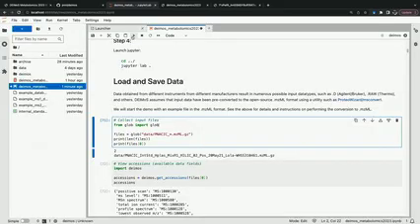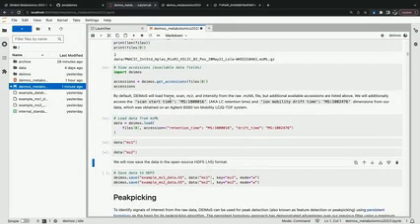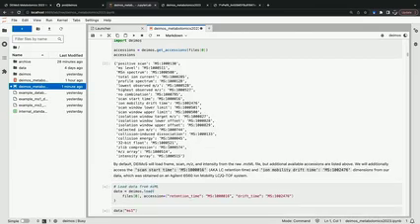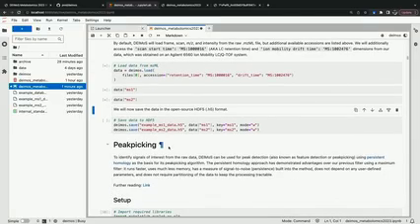So we do work closely with IVET, and I think we don't have inbuilt compatibility with the MZA format yet, but we are aware of MZA, and that'll probably be implemented in a future version of DEIMoS. For now, we're mostly assuming mzML as the standard format, since that's more commonly used in the field. Okay.